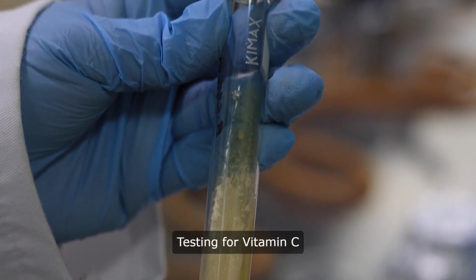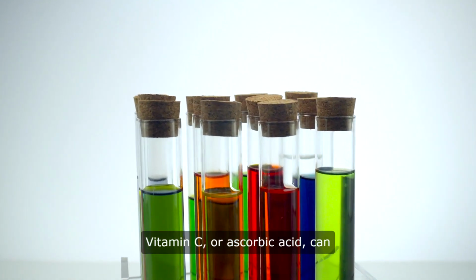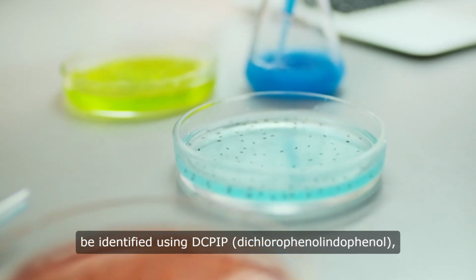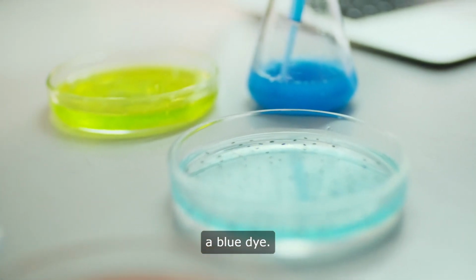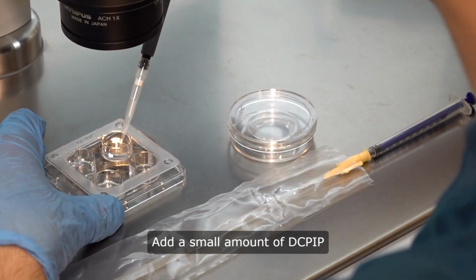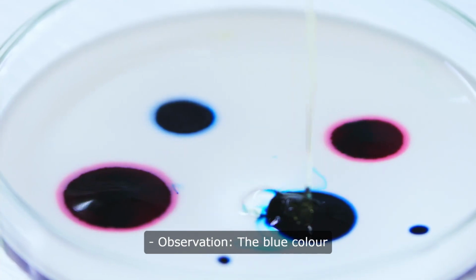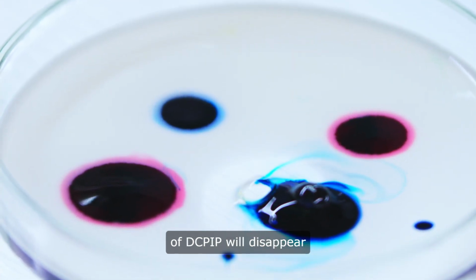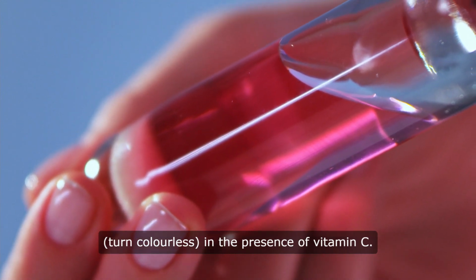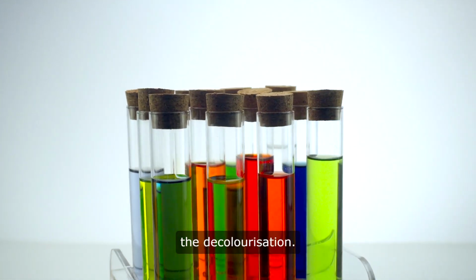Testing for vitamin C, DCPIP test. Vitamin C, or ascorbic acid, can be identified using DCPIP, dichlorophenol indophenol, a blue dye. The procedure for this test is: 1. Add a small amount of DCPIP solution to the food sample. Observation. The blue color of DCPIP will disappear, turning colorless, in the presence of vitamin C. The more vitamin C, the faster the decolorization.